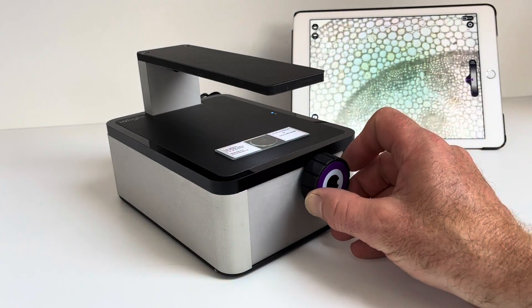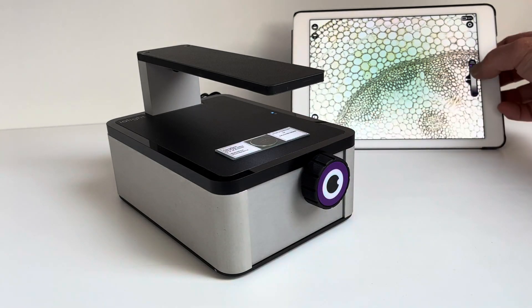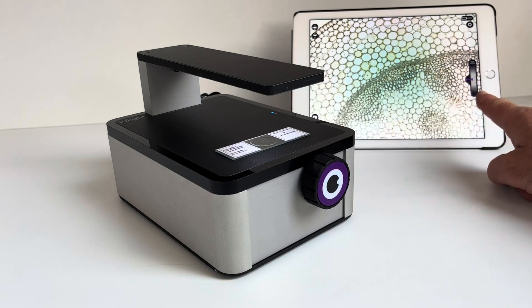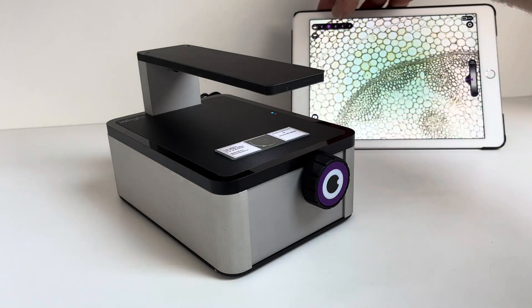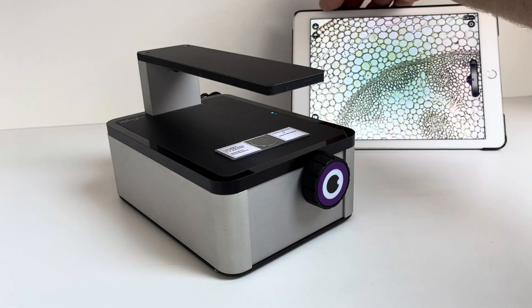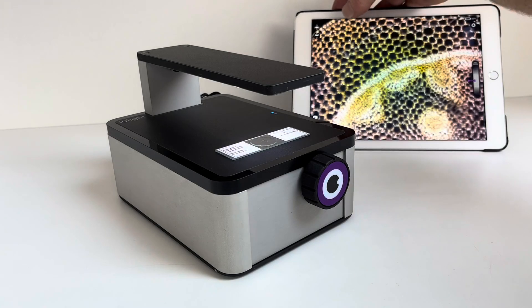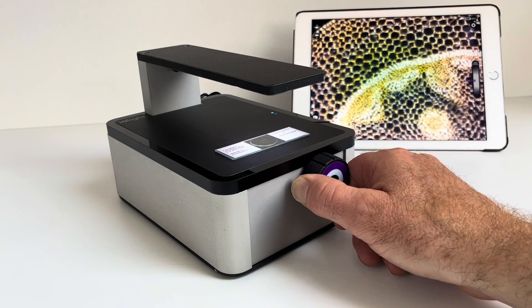You've got a coarse focus control on the front of the microscope, and you've got a fine focus control here on the screen as well, so that if you are using it in a glove box or an incubator you can use that outside of the glove box or incubator. You've got various illumination options: conventional bright field illumination, a low numerical aperture bright field which gives you more contrast, and dark field as well, which is great for certain samples. This sample looks really nice under dark field.